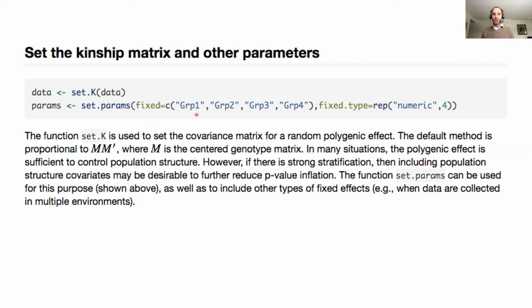If you want to change the minimum minor allele frequency, which the default is 0.05, you would change that here. If you want to change the maximum genotype frequency, which is not something that you hear a lot about, but it turns out that once you start to look at simplex dominance models or duplex dominance models, you can find that you just don't have enough instances of the two different classes to make the test worthwhile. And so you can reduce the number of tests and improve your thresholds by modifying that. The default is 95%. No one genotype class can account for 95% or over 95% of the instances.